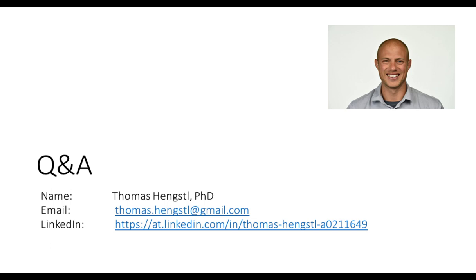The other thing that could be meant by this question is the number of sequences you need per library. What we found is, depending on the enrichment, it's helpful to have between 10 and 50,000, and that's just a rule of thumb. With today's technologies, you can easily have 100,000 per library, and this is really just a math thing.